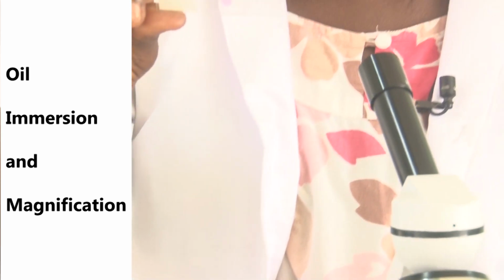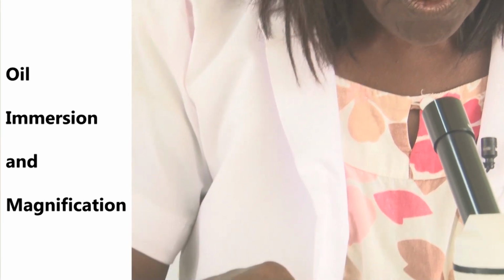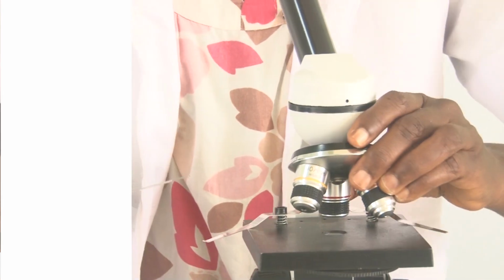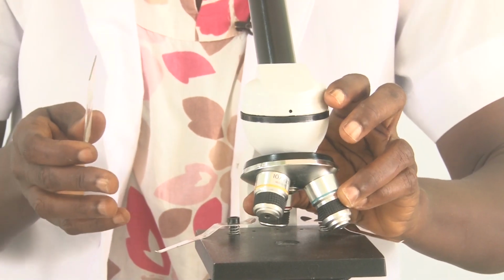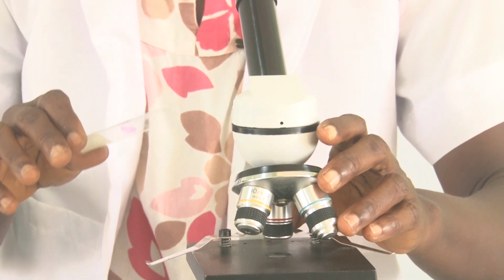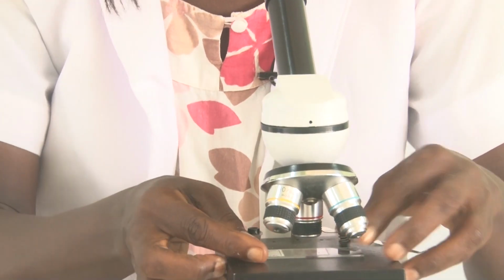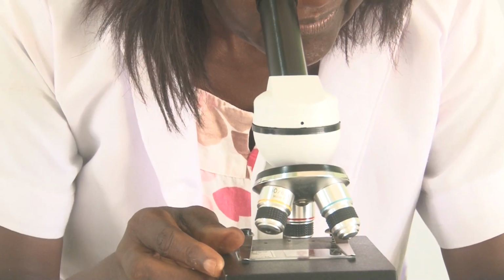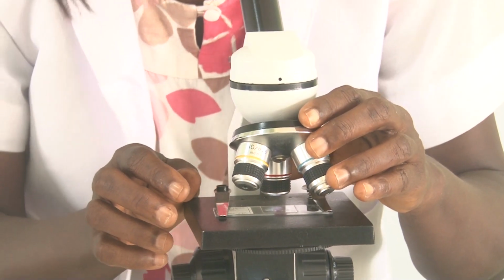So this is a prepared slide we have. We want to look at this slide. So we fix our objective in line with the eyepiece. You heard a click. We look at this specimen under low power. All right. Now we have to look at the specimen under high power.